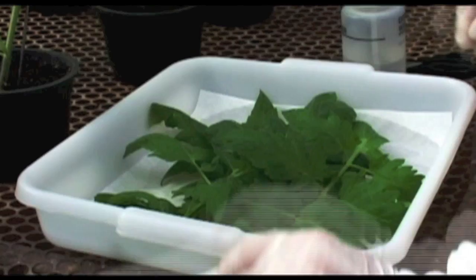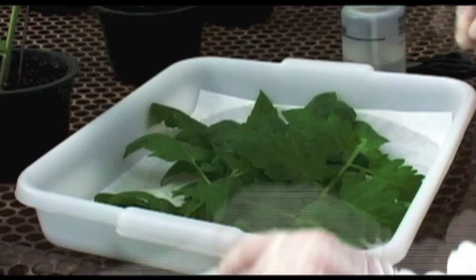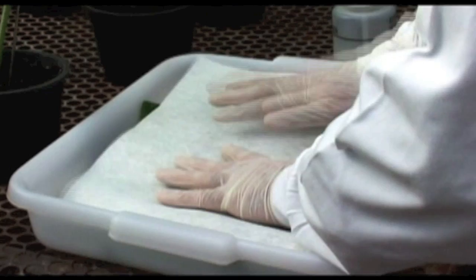The technician uses a plastic tray lined with paper towel and sprays water on it to keep the leaves fresh. At the end, the tray is covered with a further moist sheet of towel.